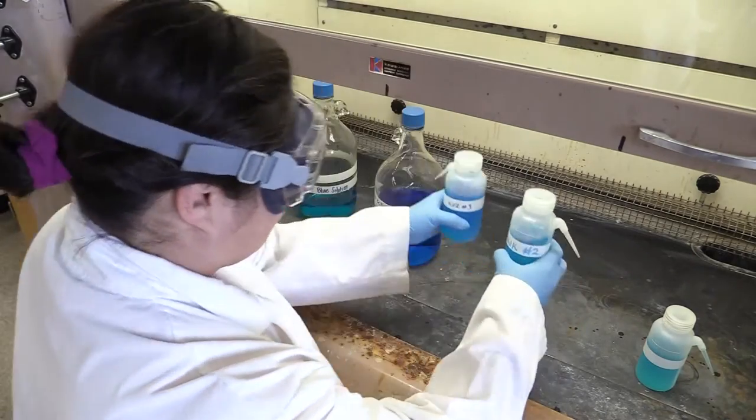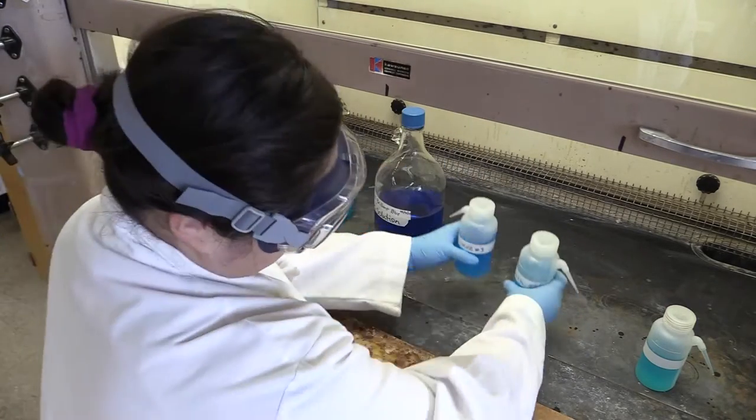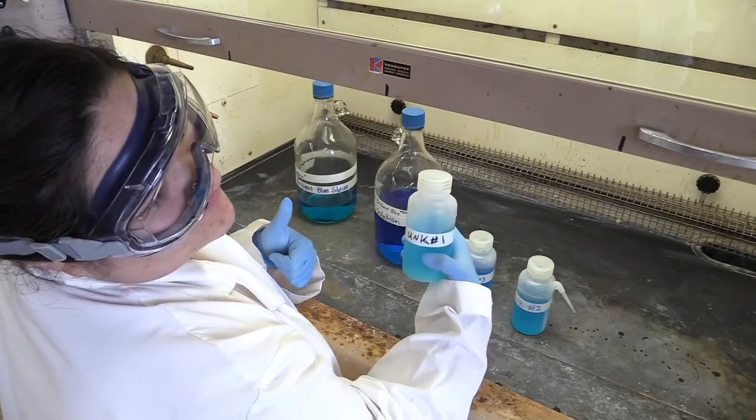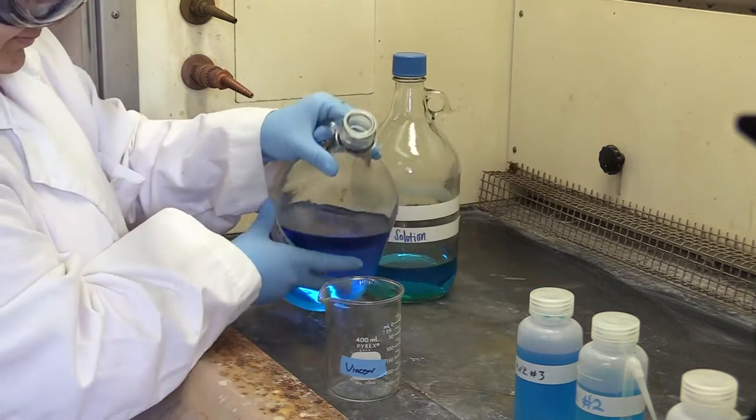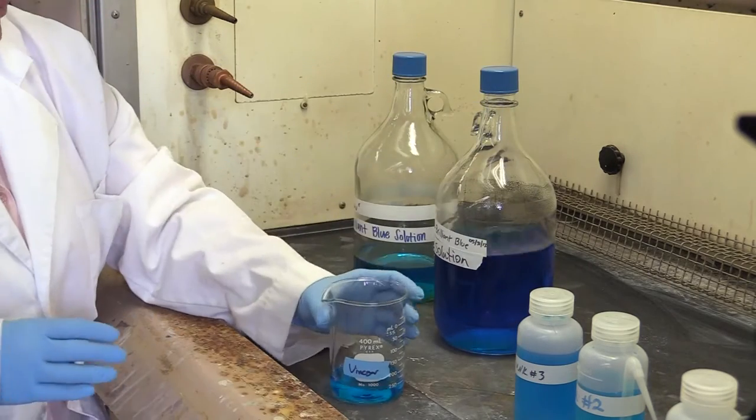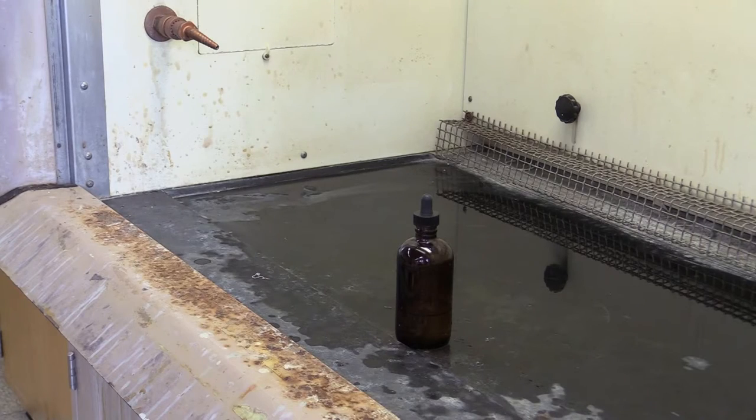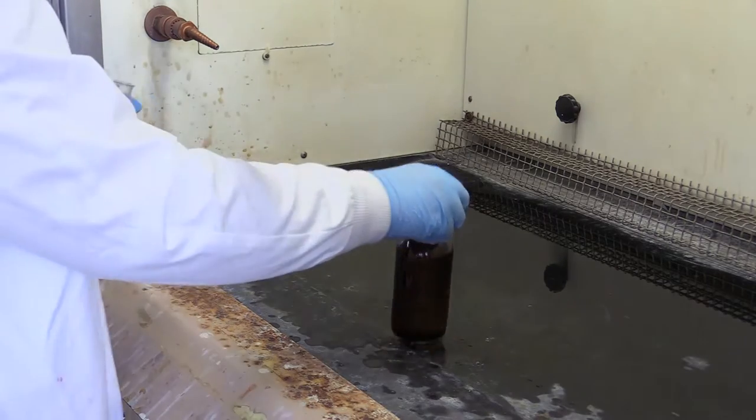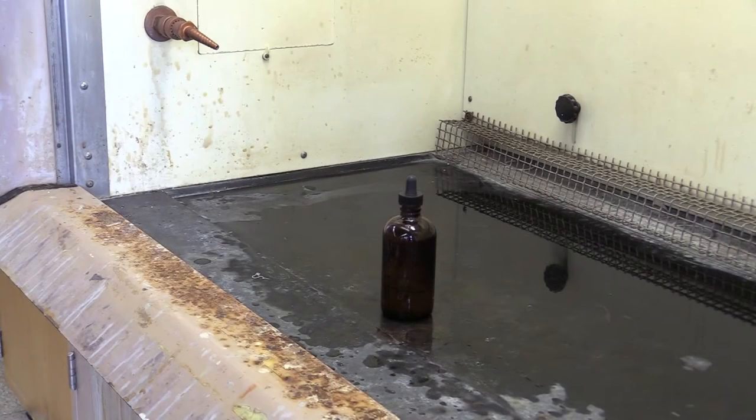Now we're on to handling chemicals. Whenever you use a chemical, check its label to make sure it's really the one you want to use. Some of the reagents you might be given are similar looking to others and are easy to mix up. When you're done getting the reagent you need, or putting waste in the waste container, make sure to get the cap back on the bottle and screw it down. Some of the compounds take on water from the air if they don't have the cap to stop this. Another reason to keep the cap on tight is if anyone comes by and grabs the bottle by its cap, and that cap is loose, bad things can happen. You can also lose points for leaving them uncapped.